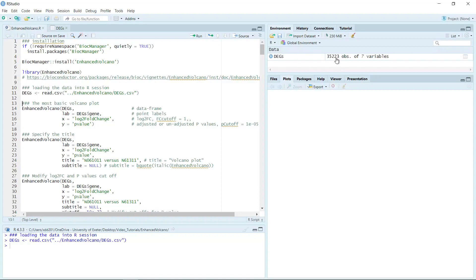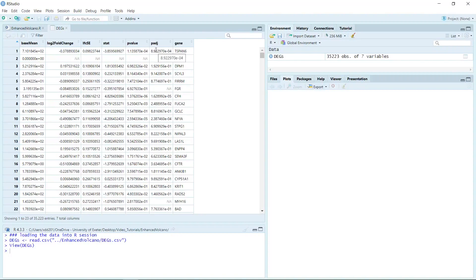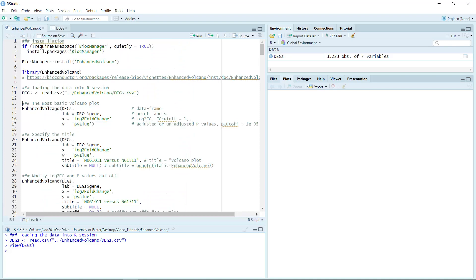You can see we have the data in the data window. We can click the data and have a look. For a volcano plot, you just need three columns: one column is the log2 fold changes, the second column is the gene names, and the third column can be the p-value or adjusted p-value. If you have already identified DEGs using DESeq2, edgeR, or FindMarkers from the Seurat package, you should have these three columns. Now we can run the basic volcano plot.